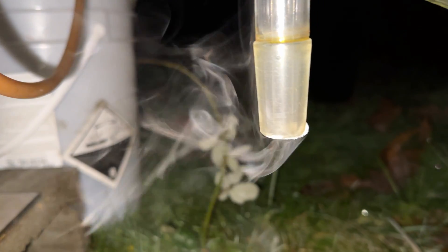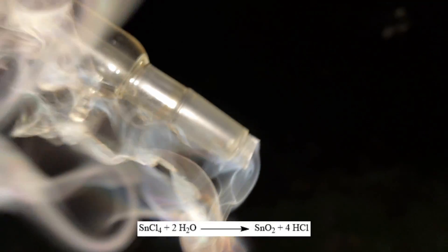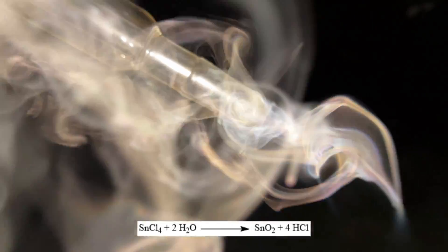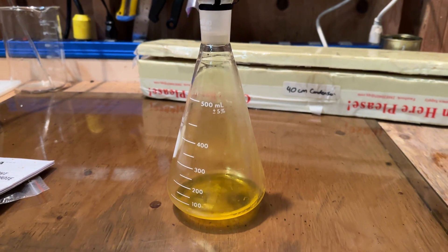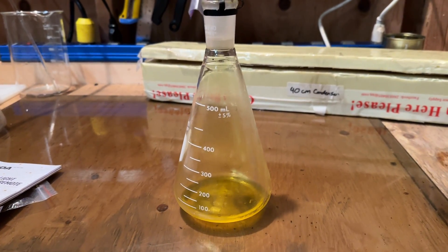As the apparatus was disassembled, the characteristic fuming nature of tin-4 chloride was observed as residual amounts in the glassware reacted with moisture in the atmosphere to produce hydrochloric acid vapor and tin-4 oxide. Anyhow, that is essentially how to produce tin-4 chloride from elemental tin and chlorine gas. I hope you guys enjoyed and I'll see you in a future project.